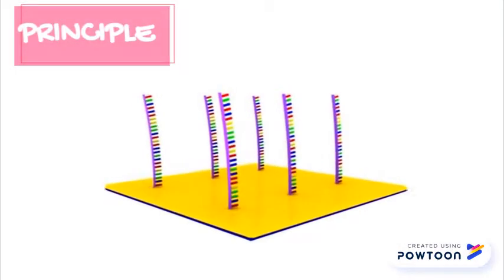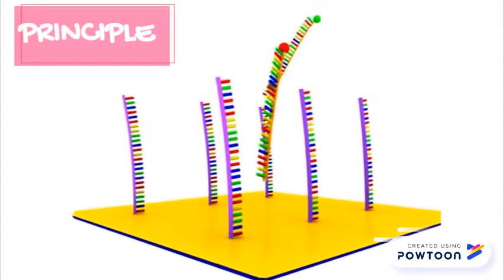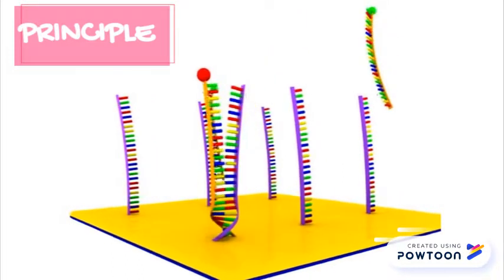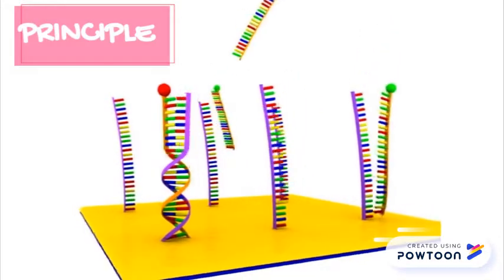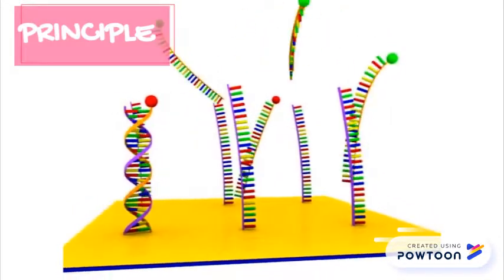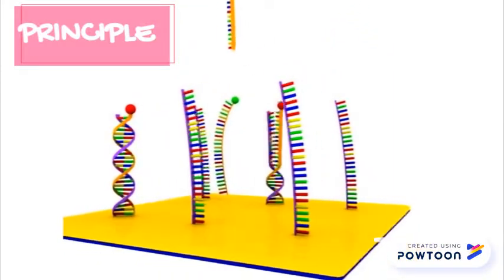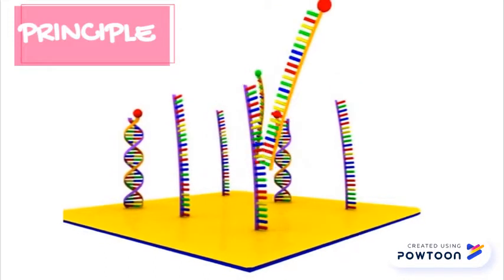The principle behind microarray is the hybridization between two DNA strands by forming hydrogen bonds. Fluorescent-labeled target sequences that bind to a probe sequence generate a signal that depends on the strength of the hybridization, determined by the number of paired bases.